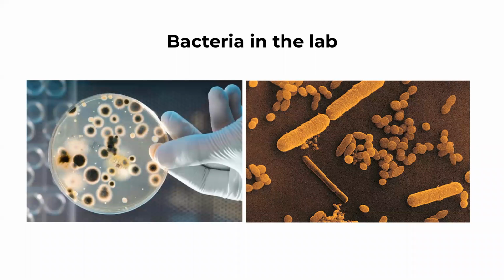And as a result of that, there has been an explosion of sequencing or high throughput sequencing technologies, and by explosion, I mean the amount of sequencing data that is being produced due to the lowering costs and the accessibility of this technology. Now we have this whole field of study called metagenomics.